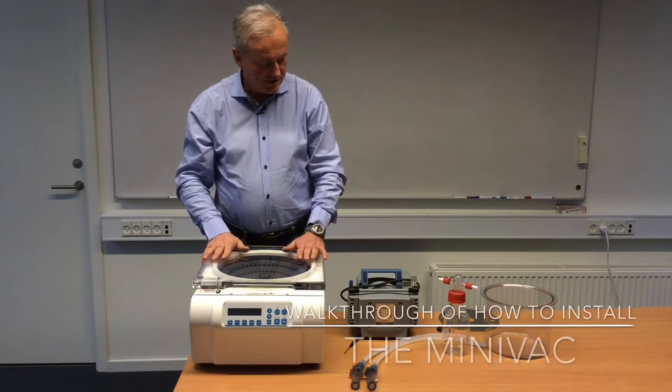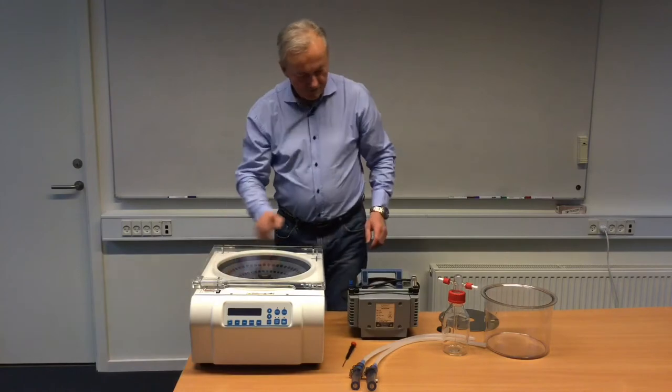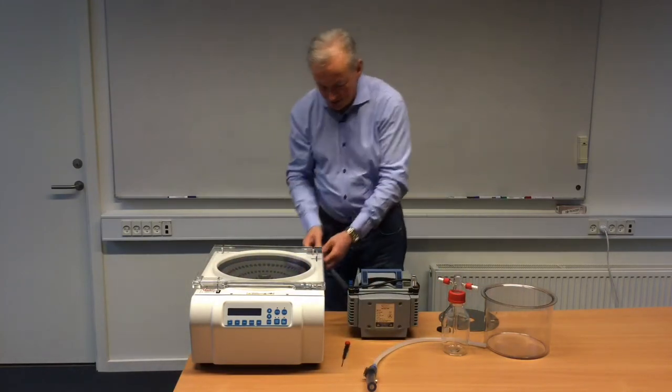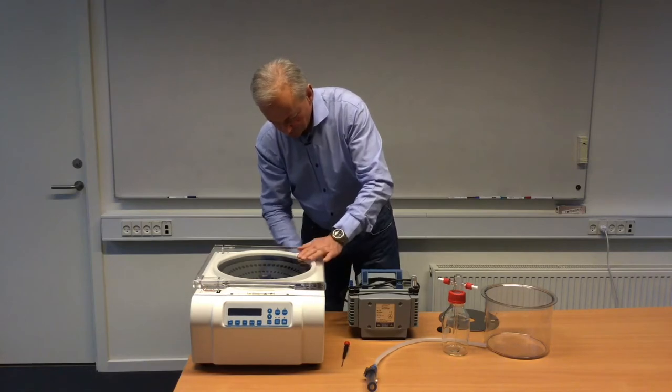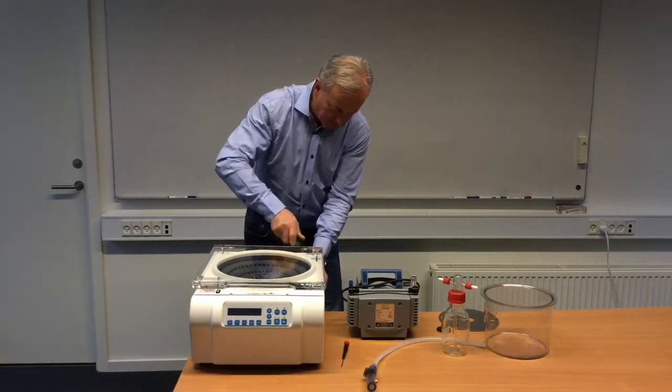We will now start the assembling of the unit so we can get it ready to work. First we have two hoses. One will fit at the back of the ScanSpeed 32, and you tie that on using a screwdriver.